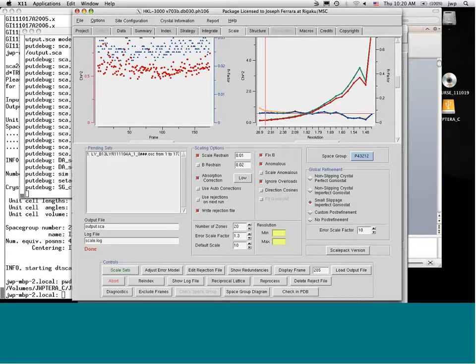And all the I minuses, by reflection off the opposite side of the plane, are treated together. If you have only normally distributed random errors, this line should be close to 1, which would be right here. The red and green lines are the crystallographic R factor, or the R merge in this case, with red having I plus and I minus kept separate, and green when you combine I plus and I minus, or treat them as equivalent.